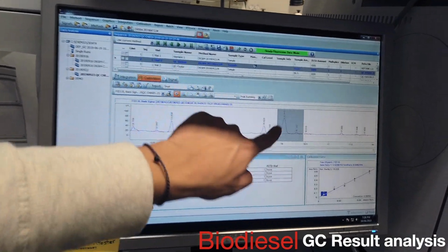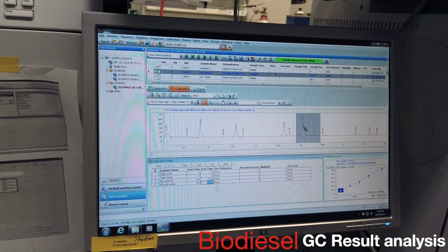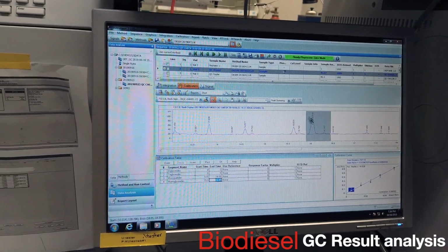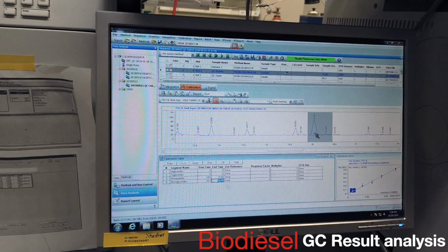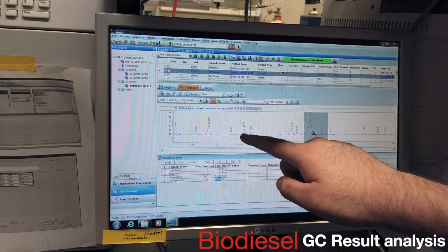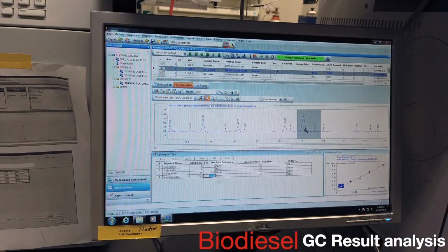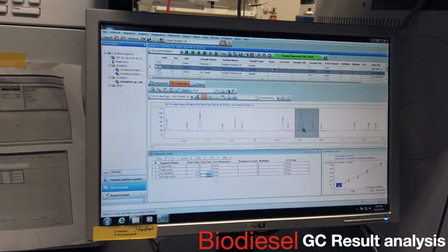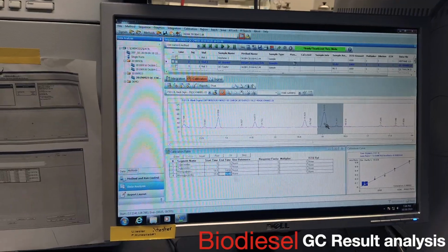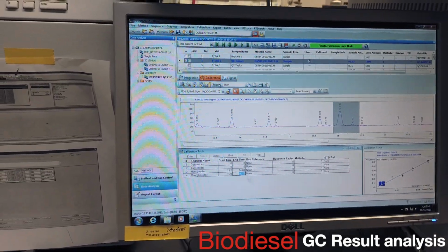How do you know that's monoglyceride? So when I did the standards, that's where it told me mono-olein is, and it overlapped with this exactly. So I know that there's a doublet here, and then there's a big peak and a little peak. So it's pattern recognition. I think Dr. Williams is pulling up an example chromatogram because I think they have one at the back of the method. Yeah, so I was looking for where the method was.